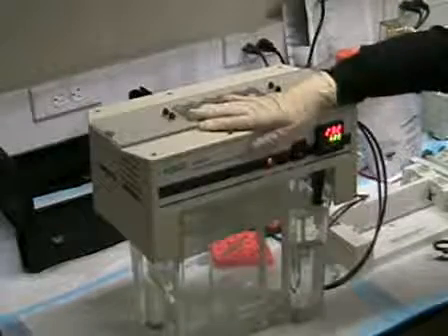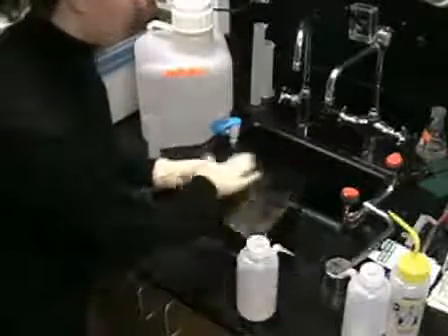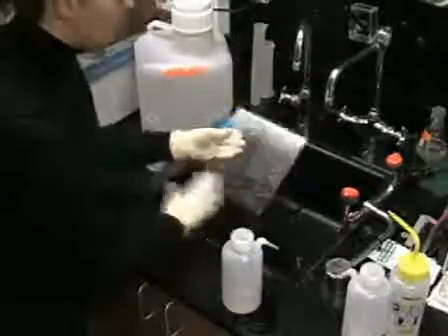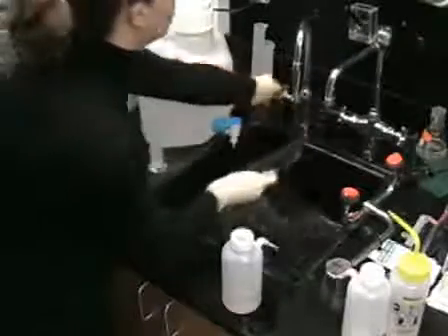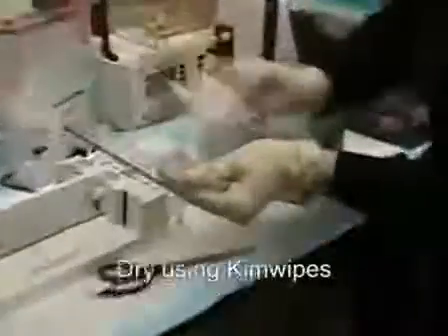Now I'm going to wash this plate with dilute Alconox solution, feeling around for impurities and dried acrylamide and things like that. Anything like that can cause irregularities in the gel. It's important to wipe off all the water.